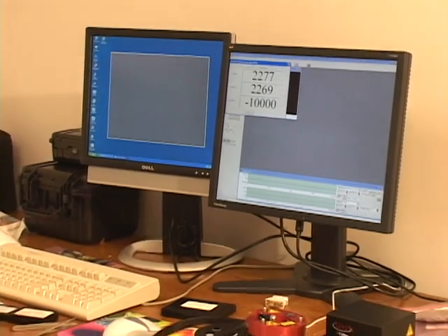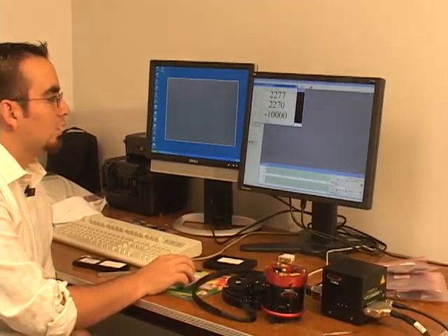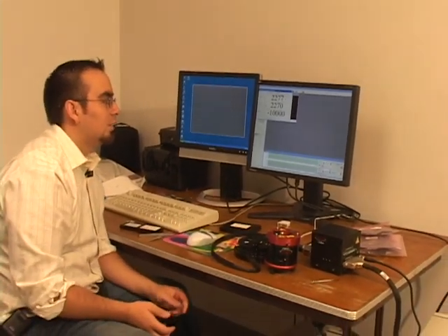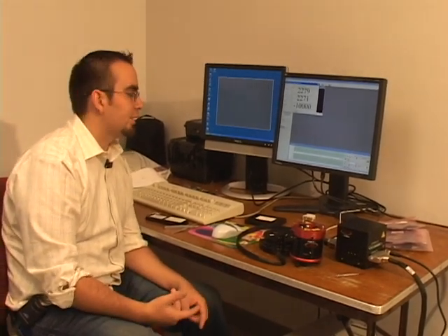And that's fine, plus minus 100 millivolts is fine on that. So with the software file, we can only do X and Y balancing. We do Z when we use the hardware file, which is a linearized file.